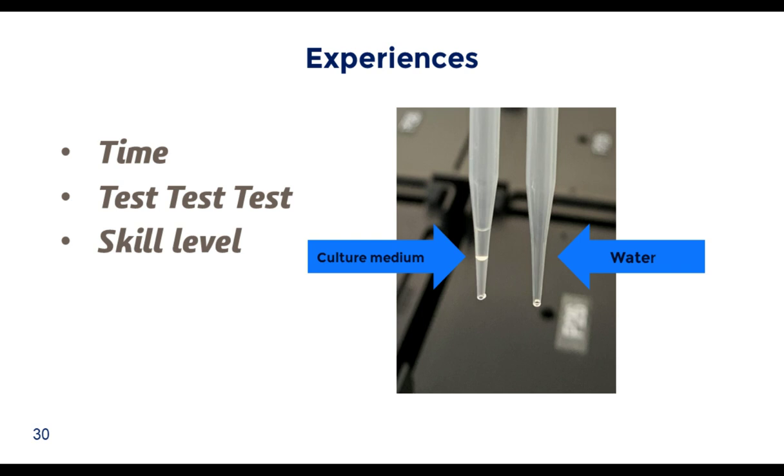Here we confirm pipetting techniques aspirate at the proper speed to allow rapid aspiration while still allowing the liquid to fill the tip. Dispense speeds are also tested to determine the speed that allows proper emptying of the tip and doesn't result in dripping due to continued sheeting of the liquid down the tip after the dispense is completed. These effects will not be seen with water. Cell culture medium has a sufficiently different viscosity and surface tension that it will perform differently.